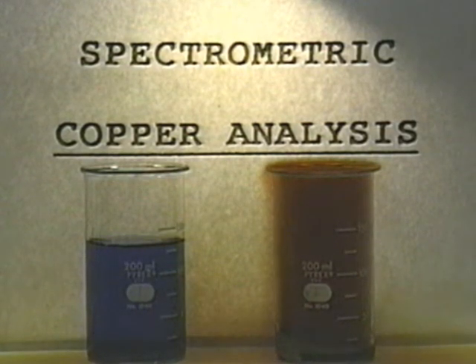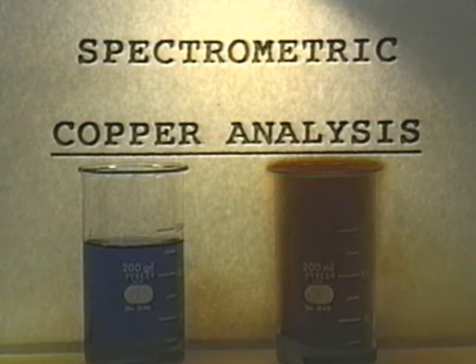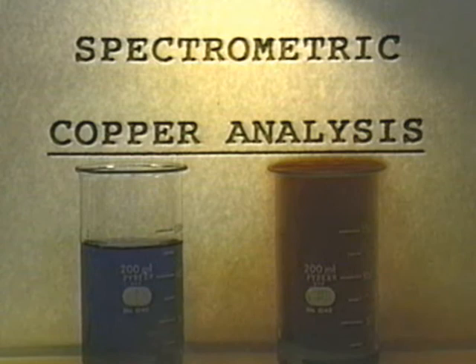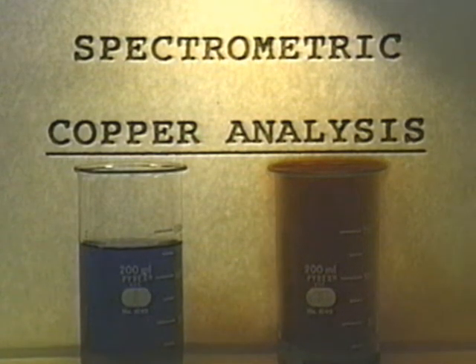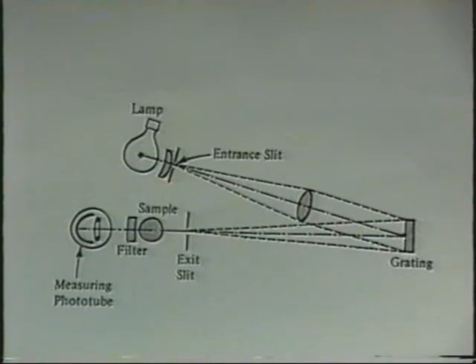Well, hello again. Today you'll be doing a spectrometric analysis for copper. In doing this, you'll use a lot of the techniques you learned earlier, so let's review those. Today's analysis will be made using a spectrophotometer.